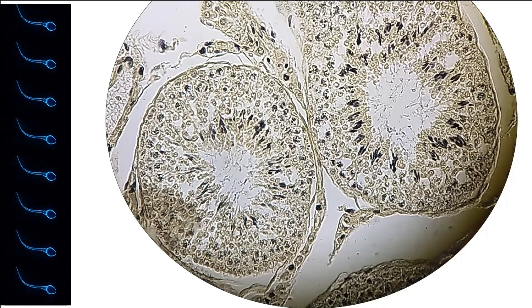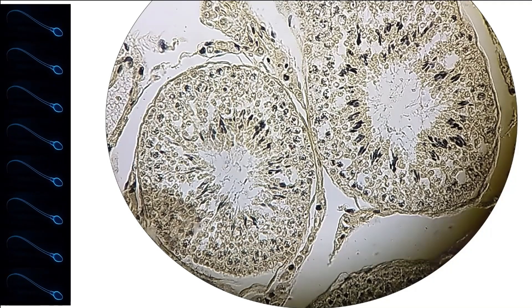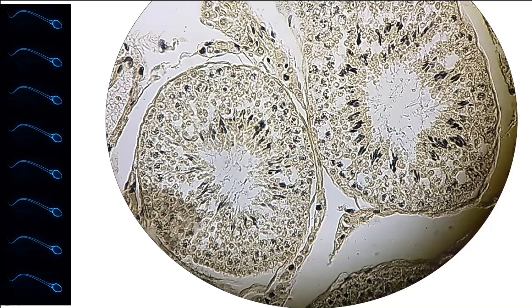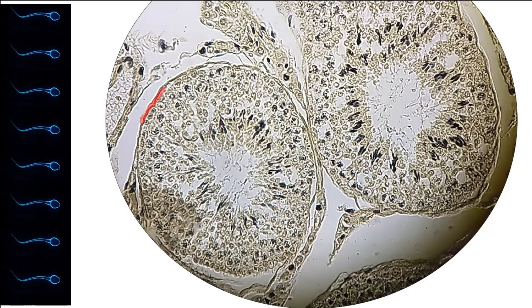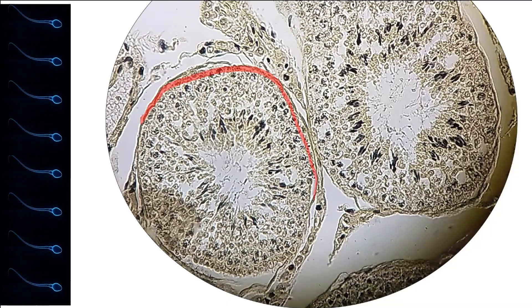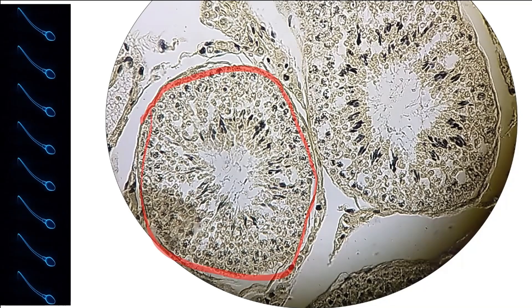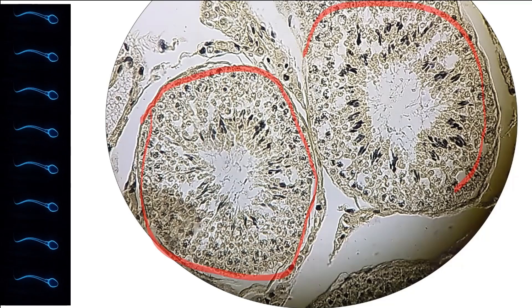This is how seminiferous tubules look like under the microscope. In this diagram, you can see there are two seminiferous tubules. This is the first one and this is the second one.